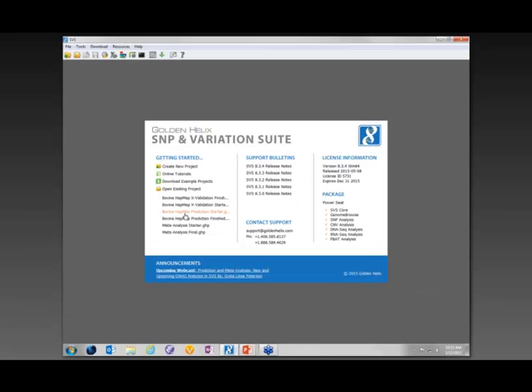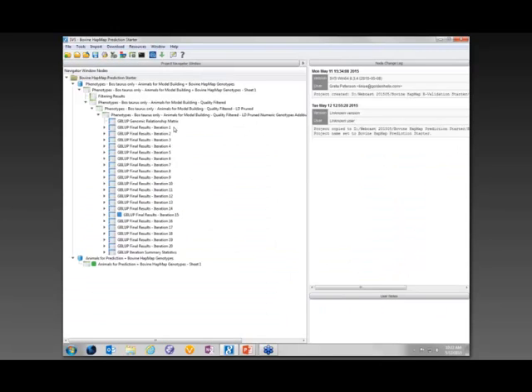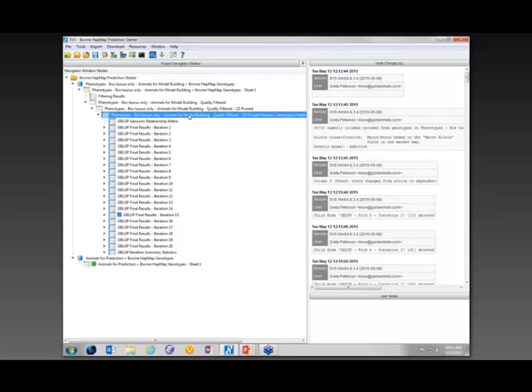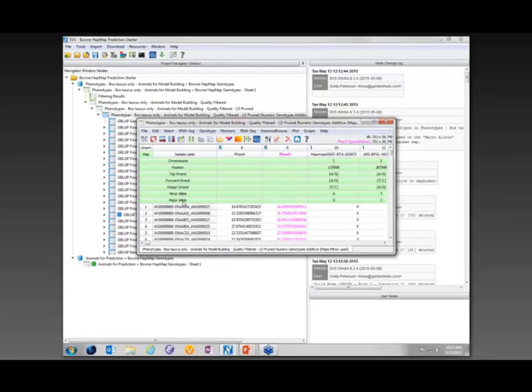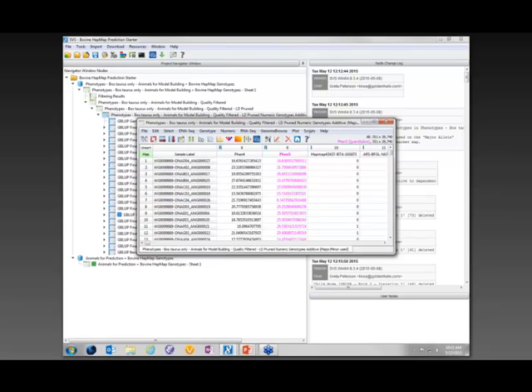So open our prediction starter project, and here again I've got 20 iterations using that same quantitative phenotype. And one thing that I didn't show is that after the data is recoded into a numeric model, the minor allele and the major allele are added to the marker map, so this information will be used moving forward as we're comparing strands. If that information is already in your marker map, it will prefer the information that you already have rather than inferring it from your data. So if you want to override the alleles used, you can use the information from the marker map if you have it available.